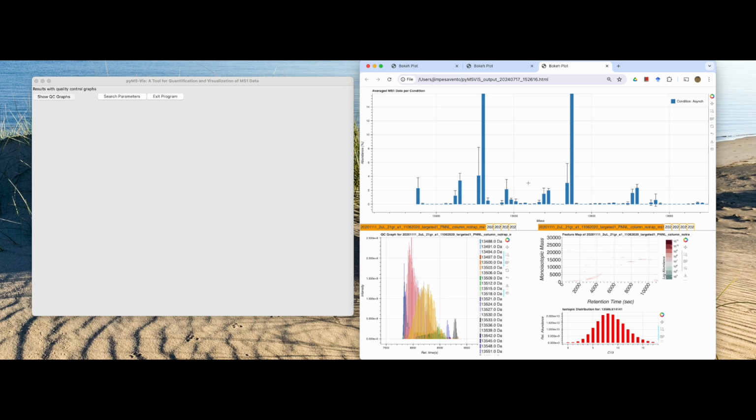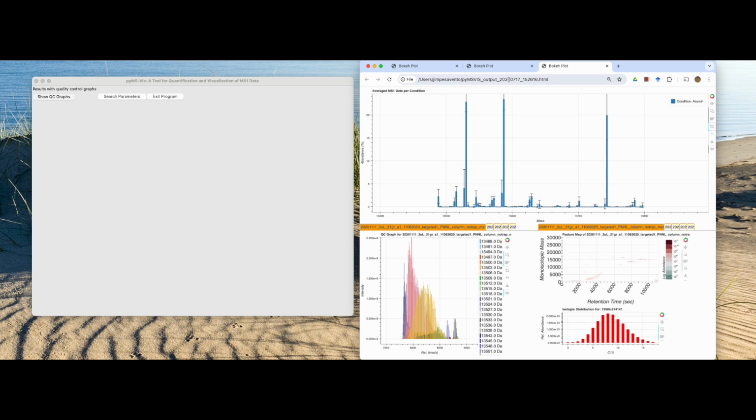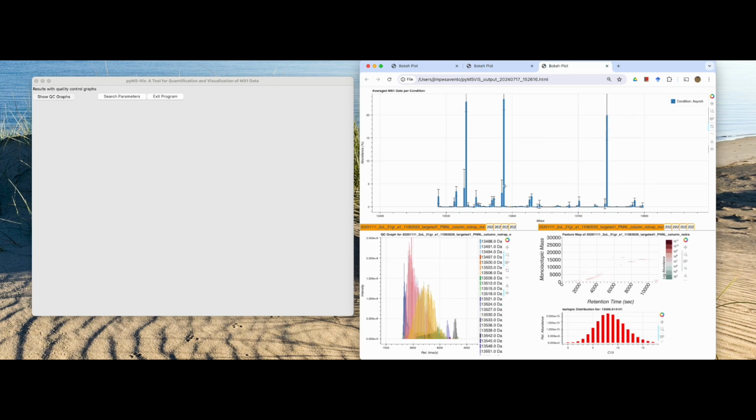So this might pull out interesting things that you were missing before. However, the dynamic search by range should basically just be used for looking for new masses. Go back to the raw data and make sure that they really exist.